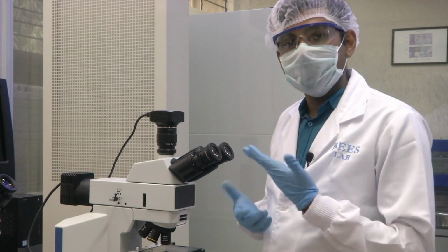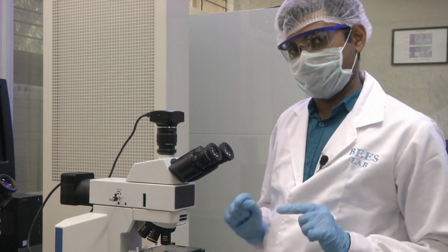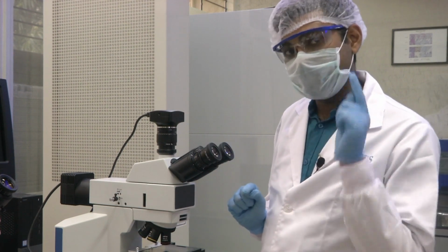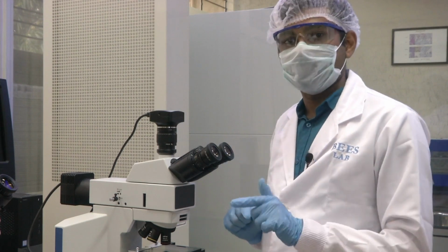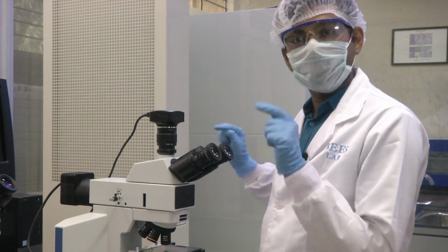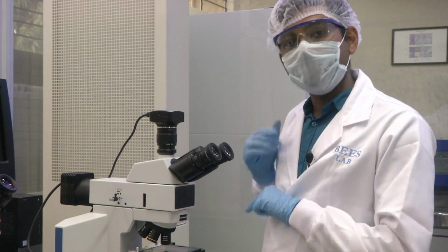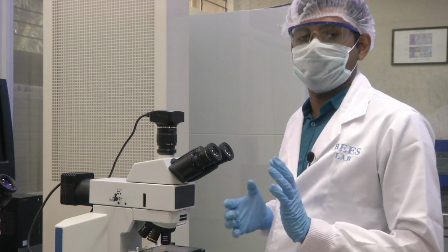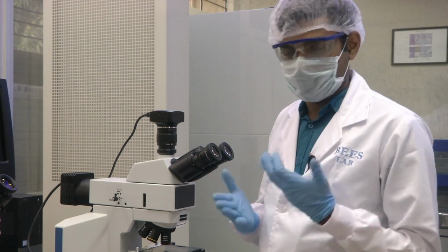When you look at the image, you will see light coming out from only where the nucleus is present, because DAPI interacted only with the nucleus of the cells. So, in the image you will see blue dots throughout your field of view, and those blue dots correspond to the nuclei of your cells. This is the basic method in which fluorescence microscopy works.